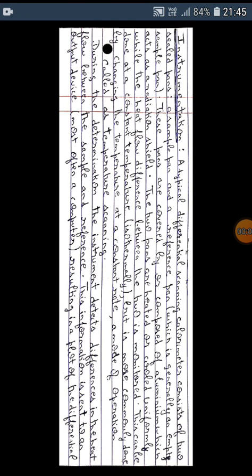Instrumentation in differential scanning calorimetry. A typical differential scanning calorimeter consists of two sealed pans, a sample pan and a reference pan. These pans are covered or composed of aluminium, which acts as a radiation shield. The two pans are heated or cooled uniformly while the heat flow difference between the two is monitored.